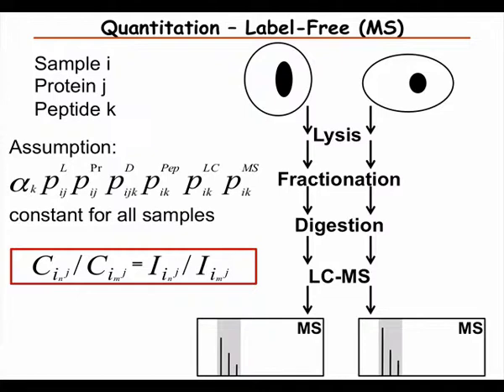But it becomes very difficult to do this experiment if you have cases where most proteins change in concentration dramatically. Then one really has to think about how to do that properly. But that's actually not only for the label-free, but for any quantitative experiment, pretty much.